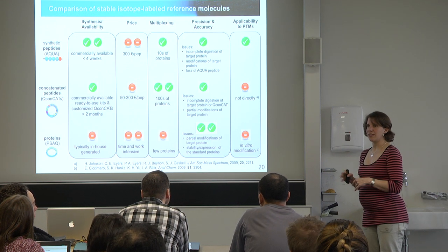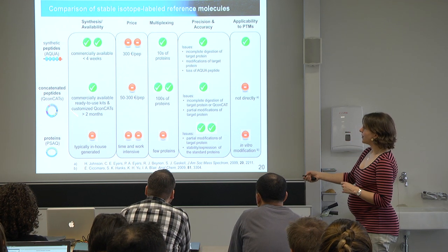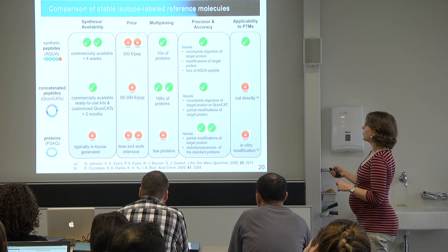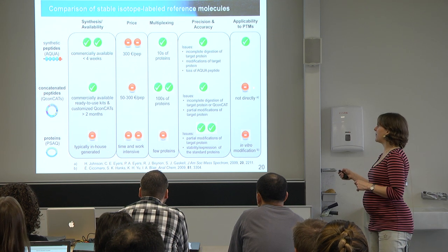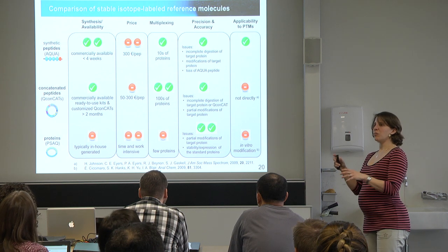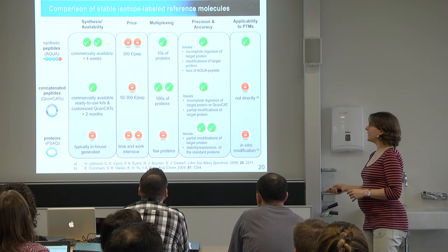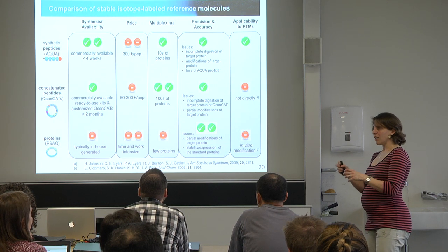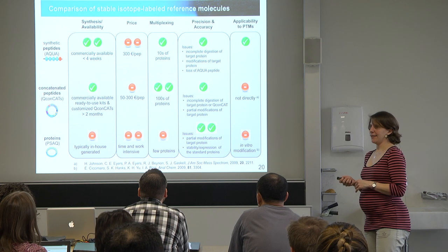Phosphorylation or acetylation is pretty easy to introduce. With those molecules, this is much more difficult. Usually what people try to do is indirectly quantify PTMs by only looking at the non-modified peptide and then say something about the modified version accordingly. If you directly want to look at the modified peptide, you stick more or less to the aqua peptides.